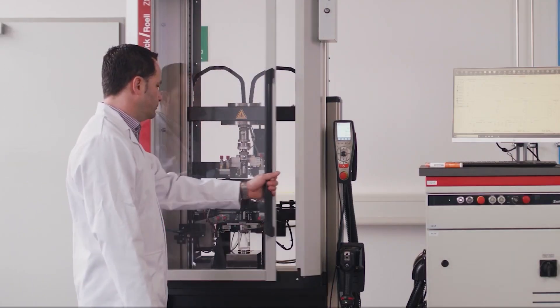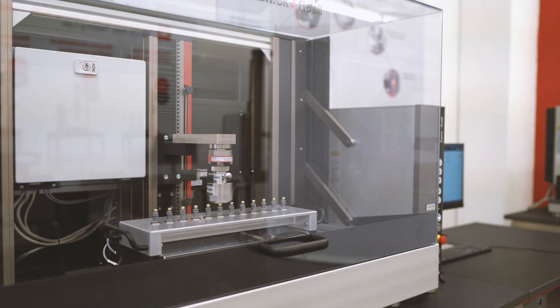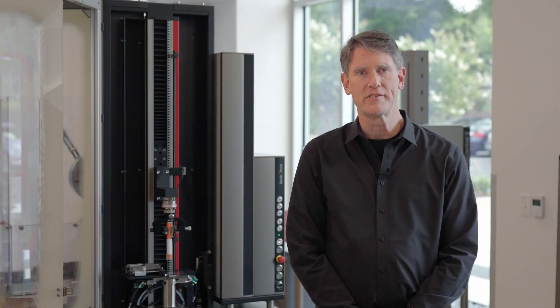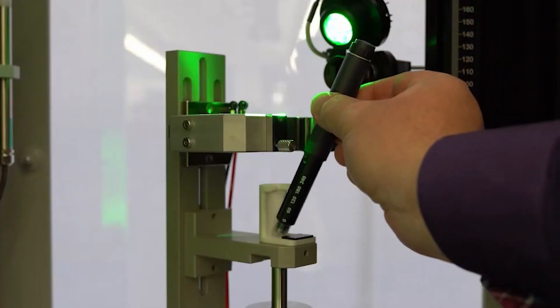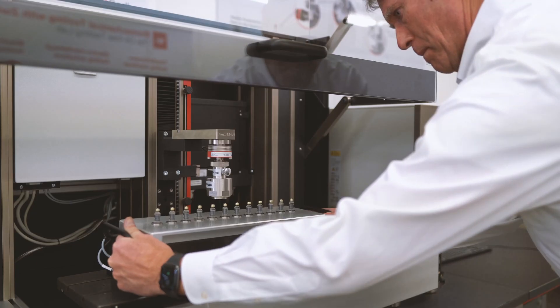Zwick Roell offers testing machines for a wide variety of applications. Typically, the operator places the specimens inside the grips, tools, or fixtures and unloads them in the same fashion.